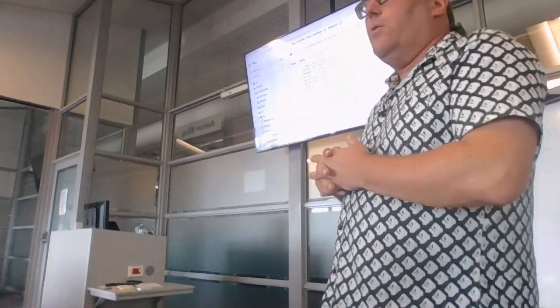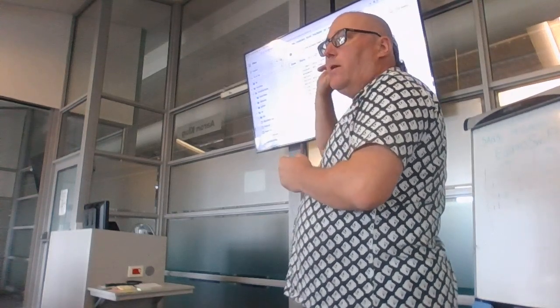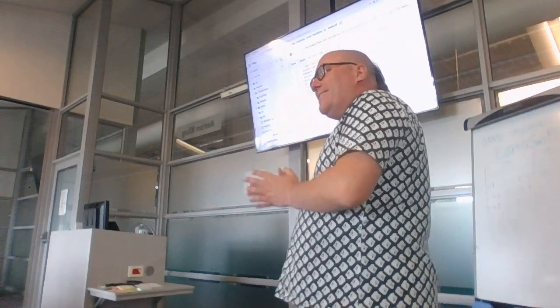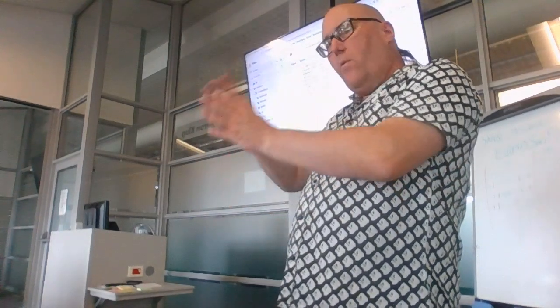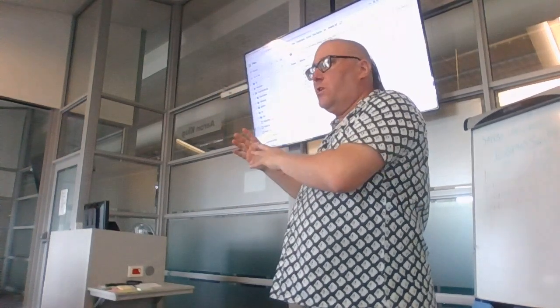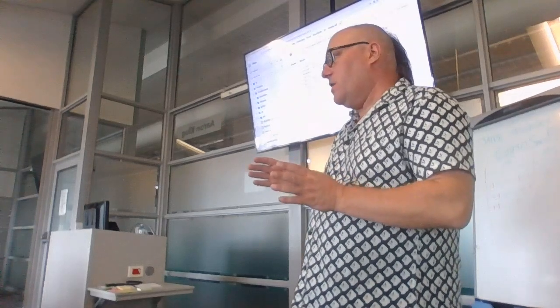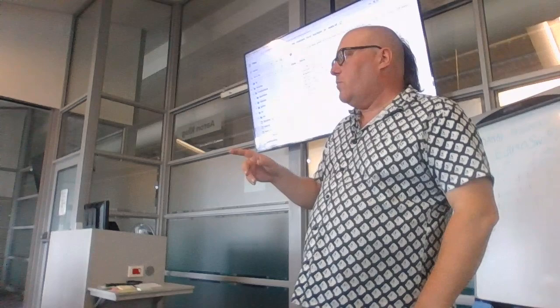Okay, so after lunch we're going to get everybody running Bactopia and doing the first step of the QC. What I want to get done today and tomorrow is, from the QC, also do the reference-based sorting out of the genomes and the phylogeny from there. That works quite easily once you've got your basic environment set up. But I see that there were some problems with the Bactopia datasets commands.